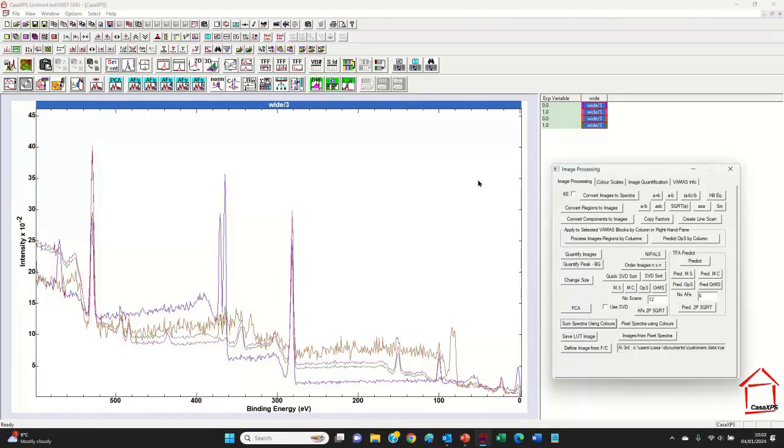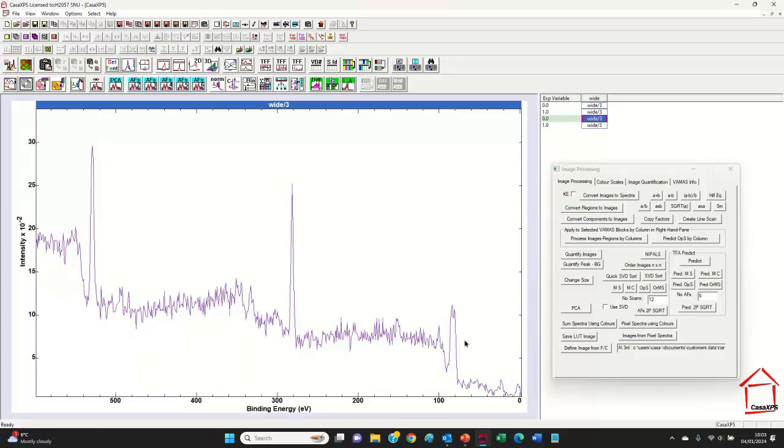The pixels may not have fully defined the zones that have different chemistry. For example, when we look at the gold, we might expect there to be an element of the glass that surrounds the gold also included in these data, and to some extent we can see there are structures that might be consistent with some of the glass.